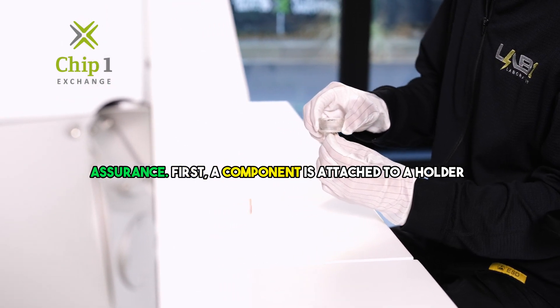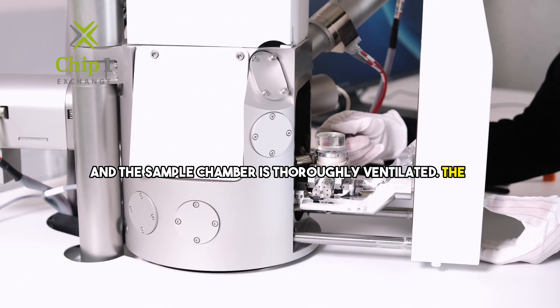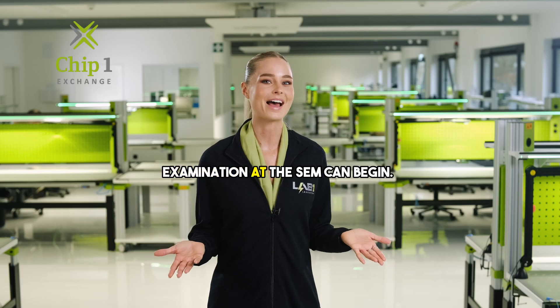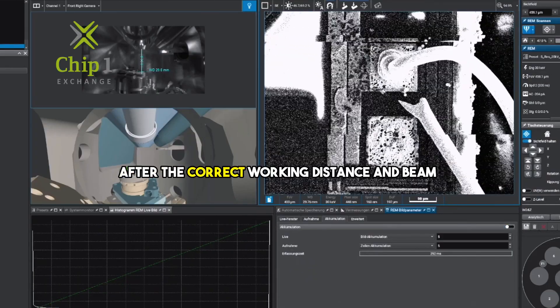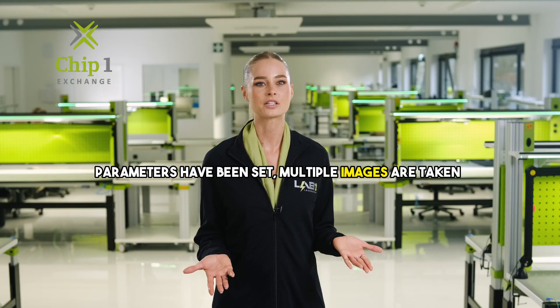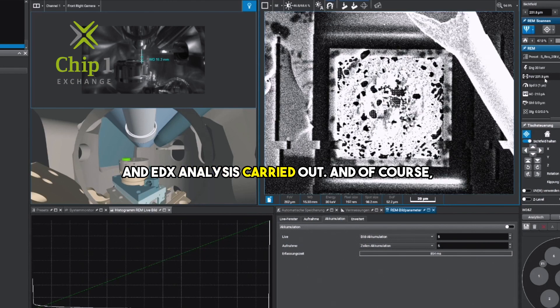First, a component is attached to a holder and the sample chamber is thoroughly ventilated. The chamber is then closed and pumped. Now the examination at the SEM can begin. After the correct working distance and beam parameters have been set, multiple images are taken and EDX analysis carried out.